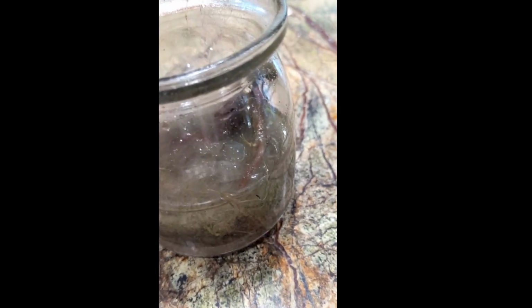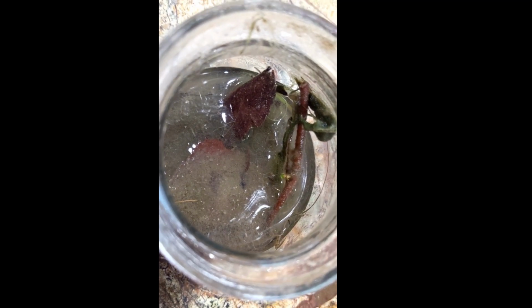Take a jar, a bottle, and then look for the mucky area where it's like dirty, full of plant material, critters swimming around, algae floating around, and just take a sample home. And that's what you want. You want it as dirty and mucky as possible. And then you can do a wet mount, and guess what you can see?